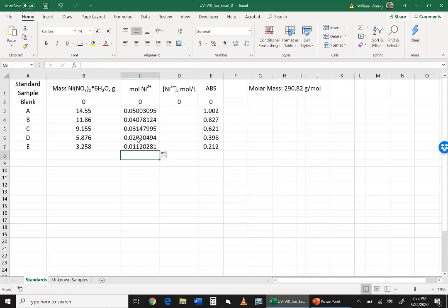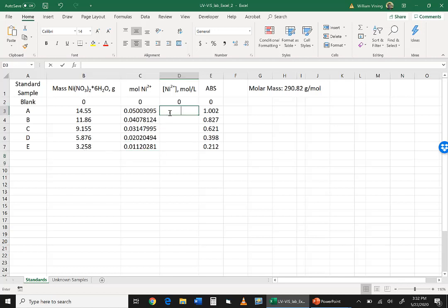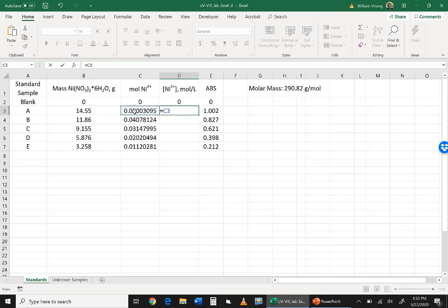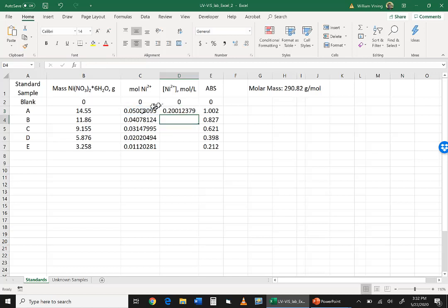Now we're going to find the concentration. And so all of these solutions were made up using volumetric flasks of 250 milliliters, so that's 0.25 liters. So we're now going to take the moles, so we have to say equals, the moles, which is this cell here, cell C3, and divide by 0.25.